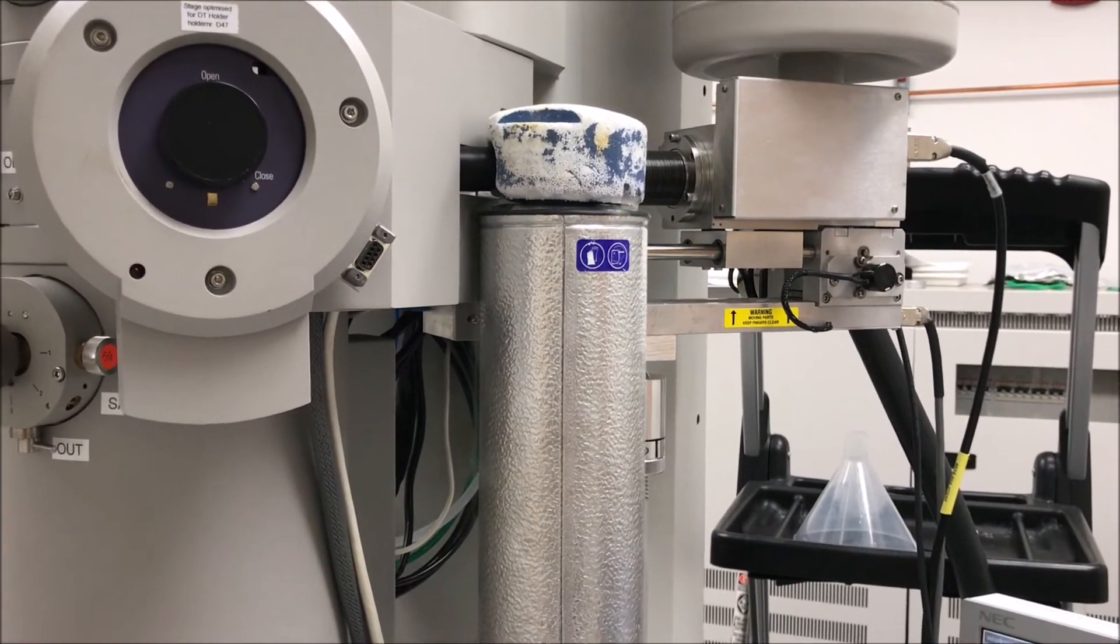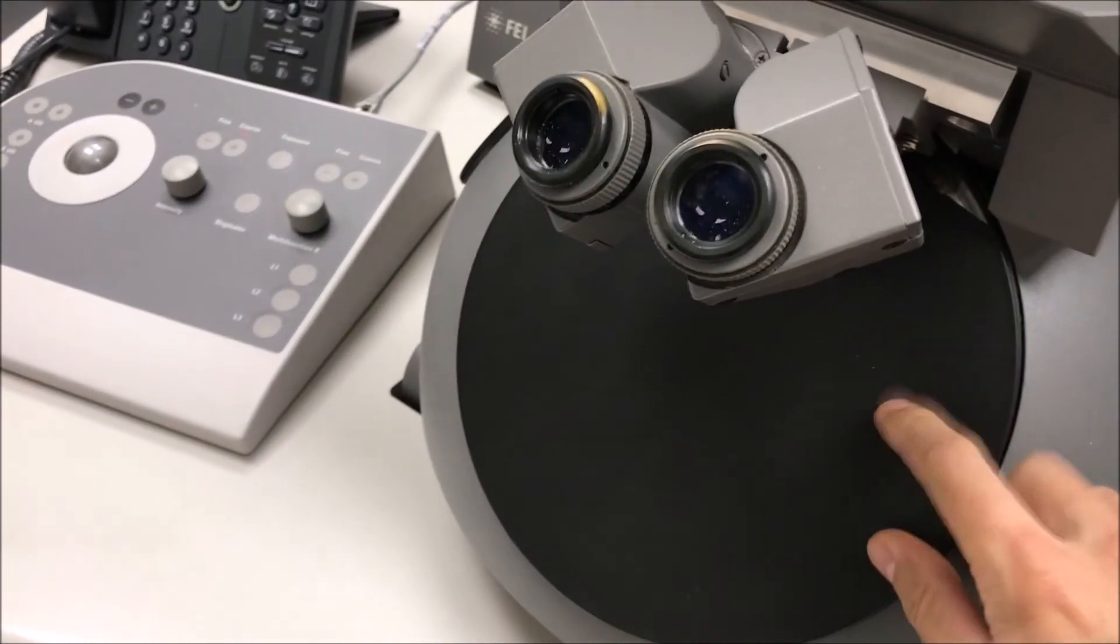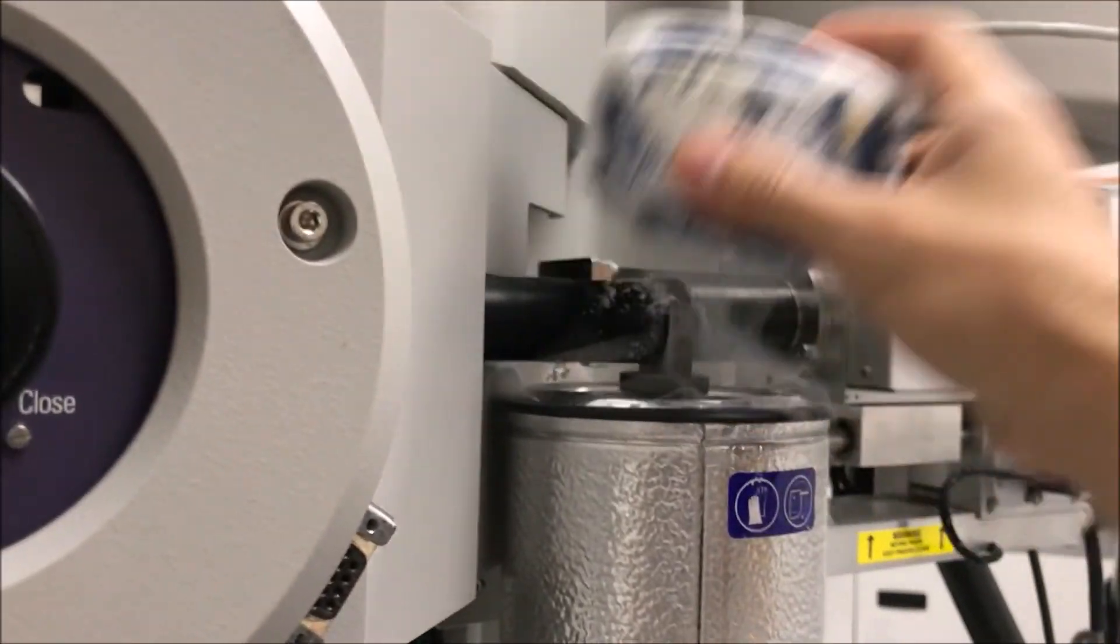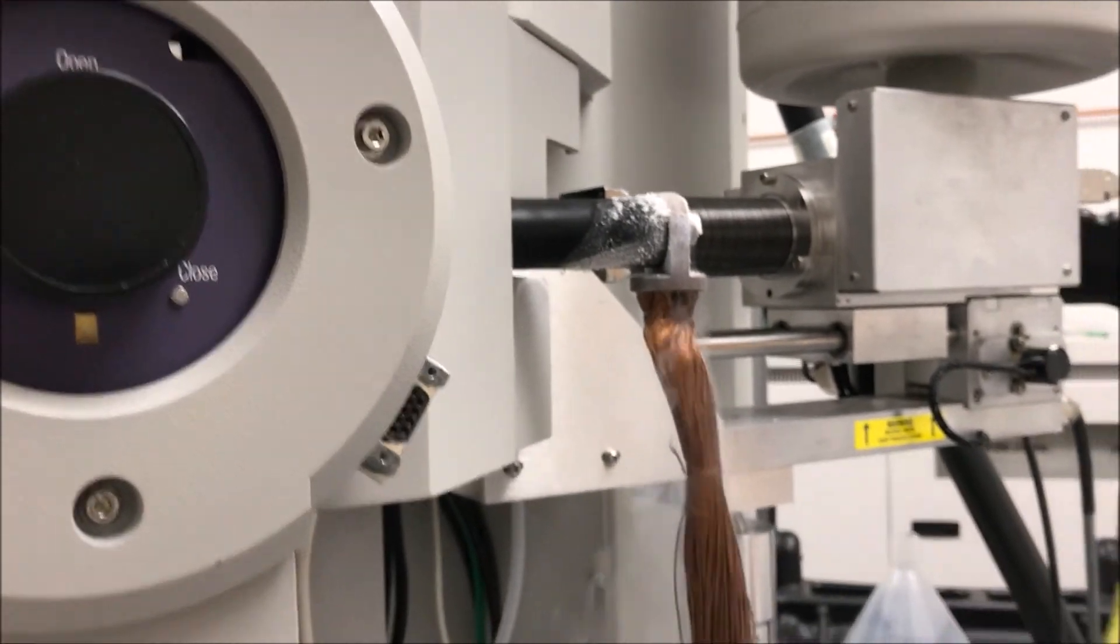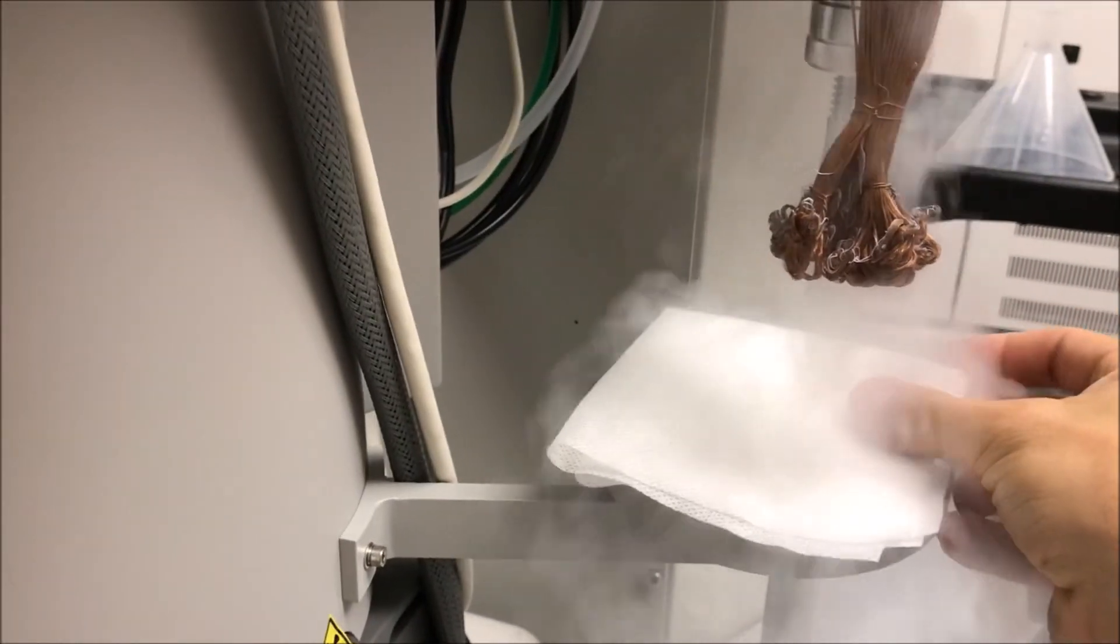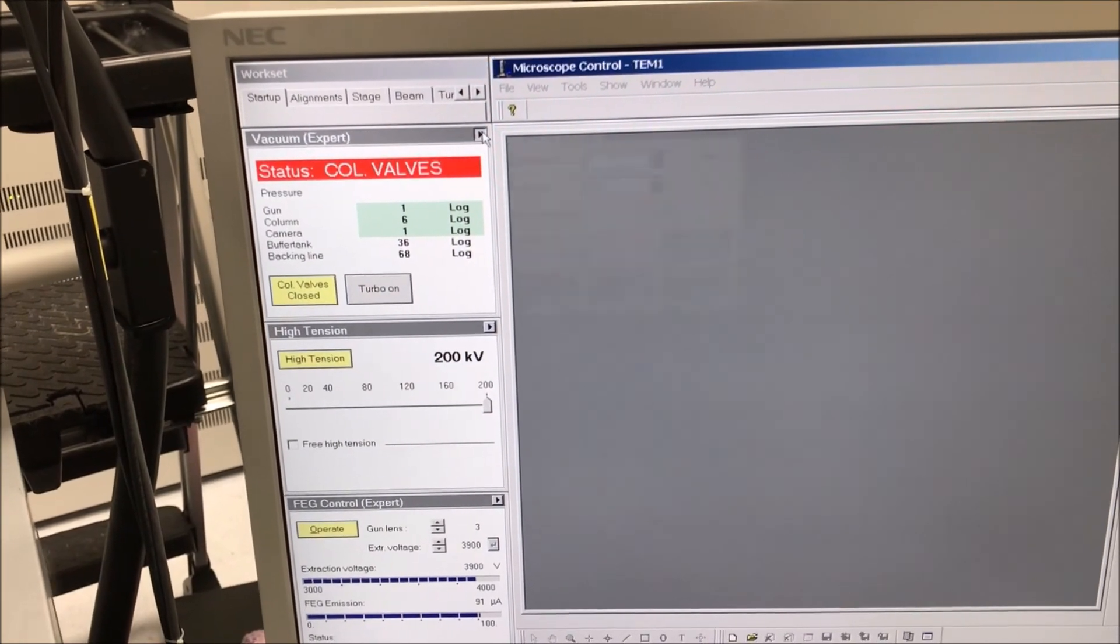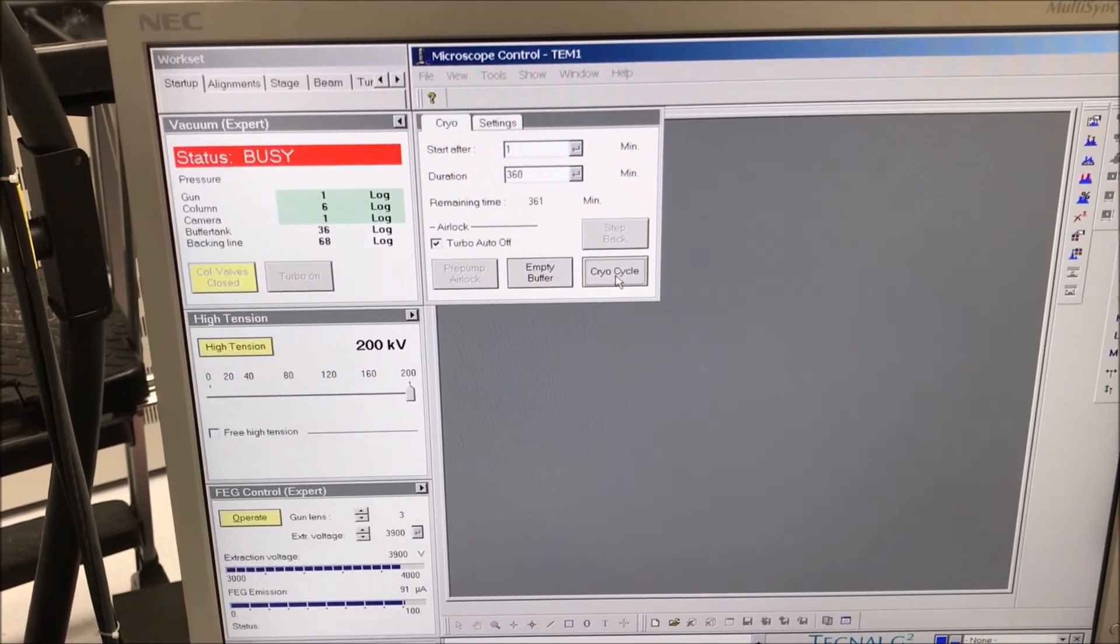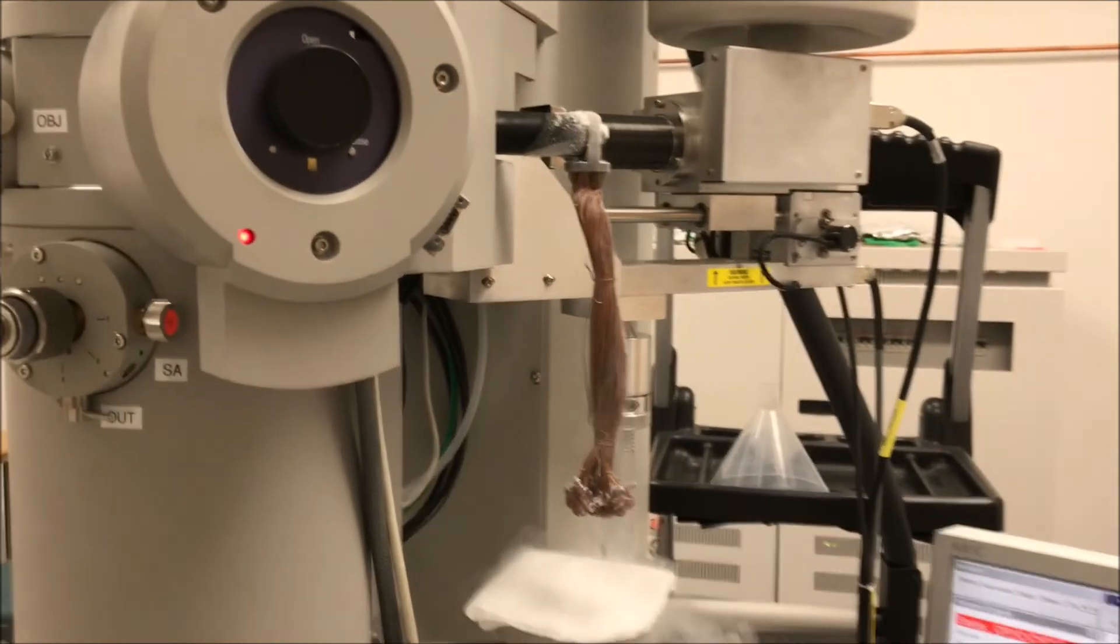To perform the cryocycle, make sure your viewing screen is covered to prevent any cracking from liquid nitrogen. Remove the foam cap and set it aside. Remove the canister and place something underneath the copper braids to catch condensation that will form and drop off. Then go to microscope control, select the status tab in the vacuum control panel, expand the flap, and there's a button that says cryocycle. Select that and that's basically it.